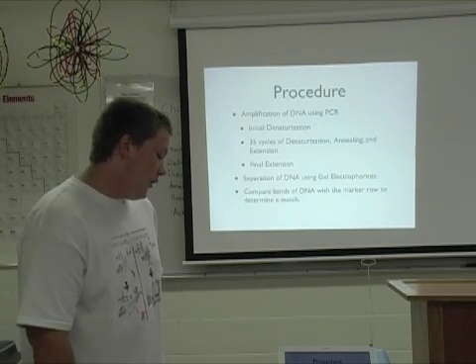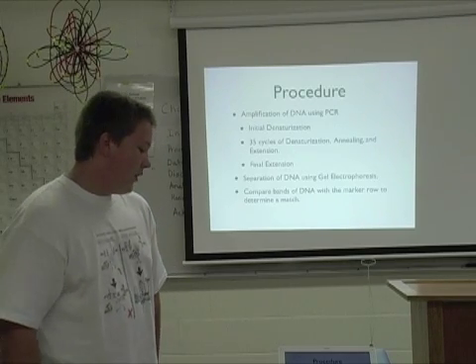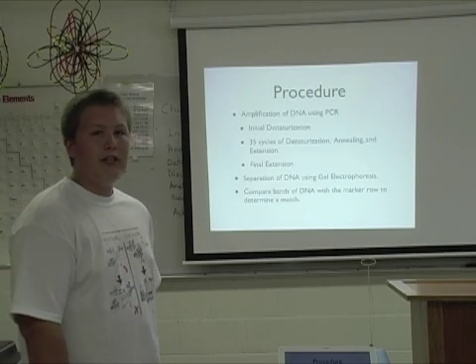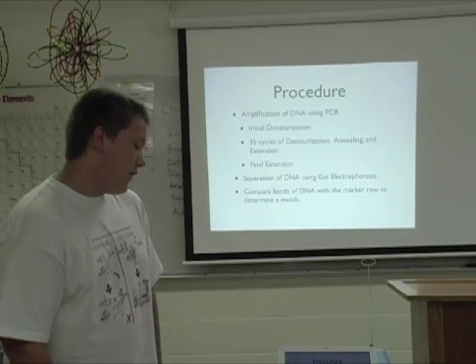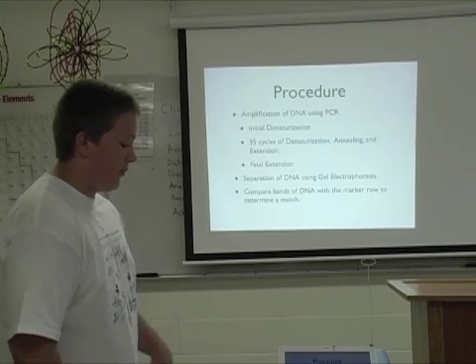And then what we did was we separated the DNA using gel electrophoresis, which we ran, and then we compared the bands of DNA to how far they were, and the marker row, which was the crime scene DNA, to determine a match.